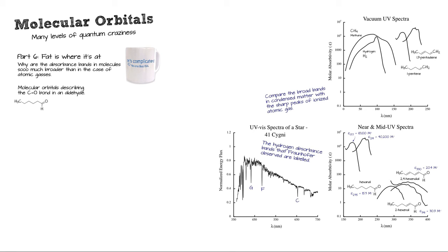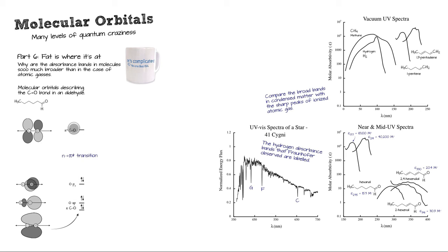So let's look at that carbonyl peak there in the aldehyde. There's our non-bonding to pi star interaction. That's where we're starting, and that's where we're ending up. And when we look at that transition, one thing you'll notice is, if I looked at that with a microscope, there's the energy level for the electron, but of course, that bond is also described by a series of vibrations. So there are the vibrational energy levels for this bond. It matters more here where the actual bonding electrons are. But if I eject these from this orbital and they land in this orbital, they could land at any of these vibrational energy levels.